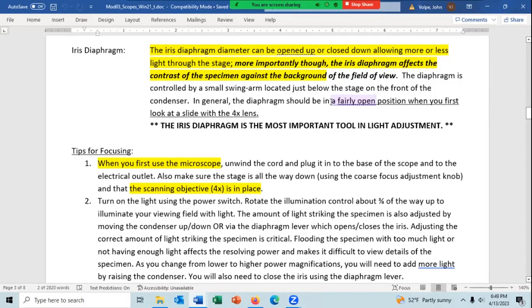And it will also give you the best... Light bends when coming through glass, and it's not that, it's the best illumination. I don't remember the term, sorry. I'm drawing a blank here, so I'll get it. Just give me a few minutes.